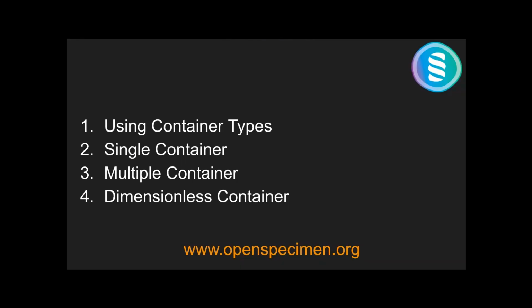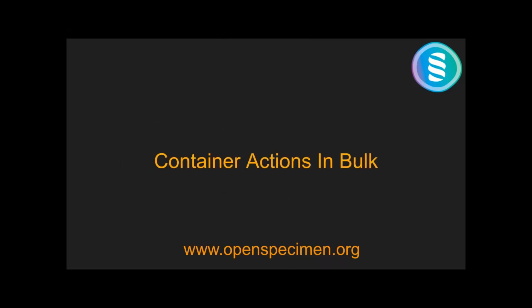And so basically, how do they manage these containers? So the lab staff will collect the specimens, process the specimens, and then send the boxes to be stored within a central facility. How is it? Brandon or Michael might be able to explain that. I think they do all of it themselves. Okay, no problem.